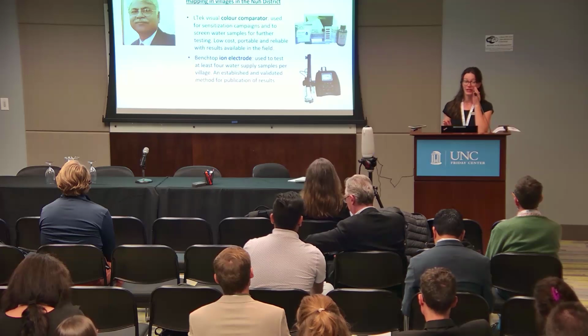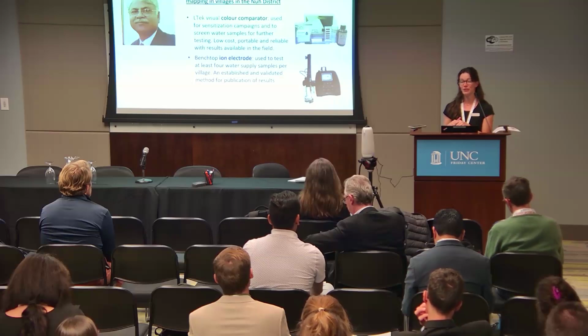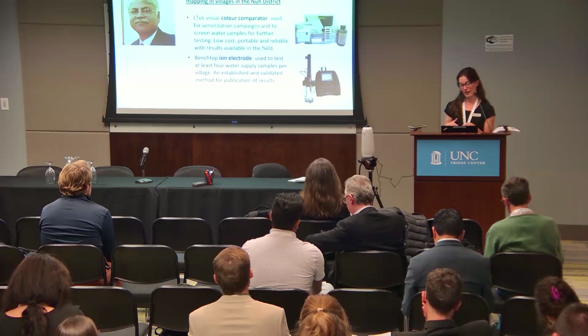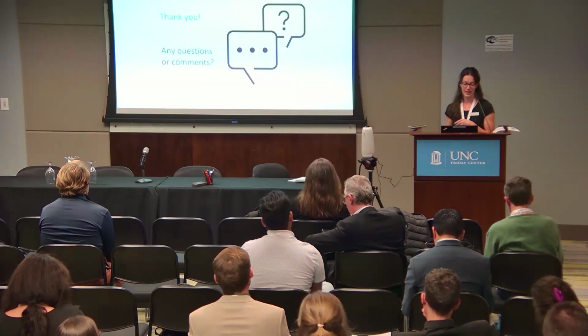So they just took this really amazing approach to screen samples with a low-cost field method, and then take the samples back to a semi-decentralized lab with the ion electrode probe. So it's a really nice case study there.